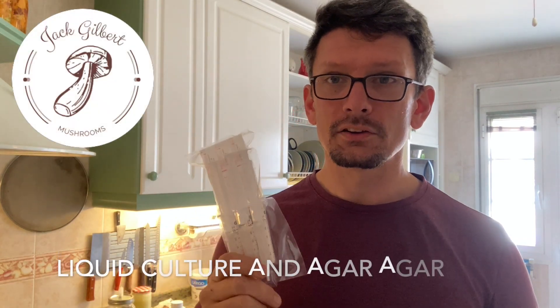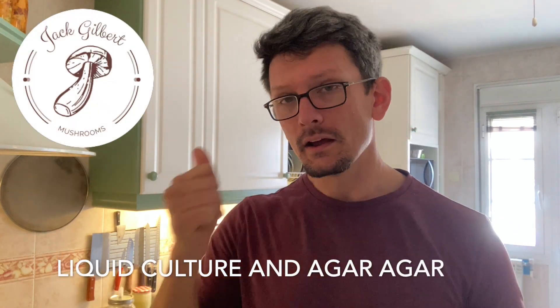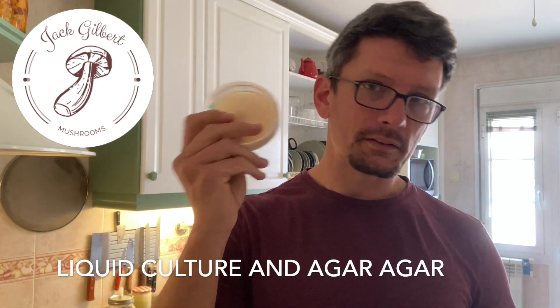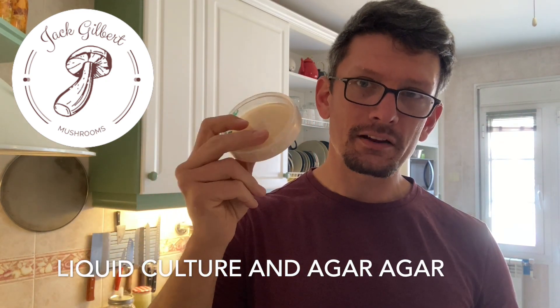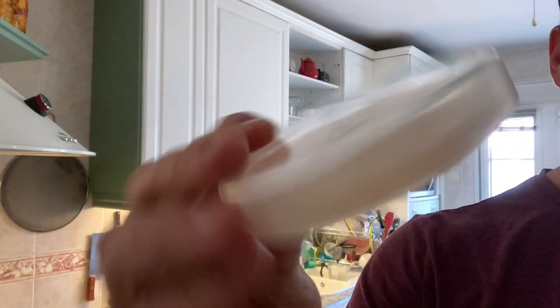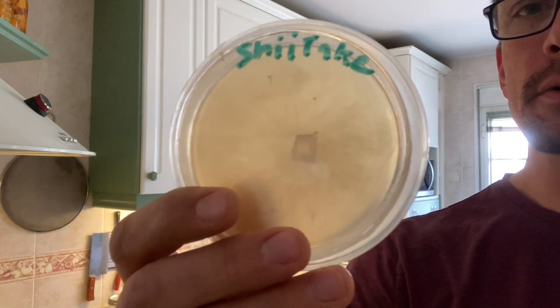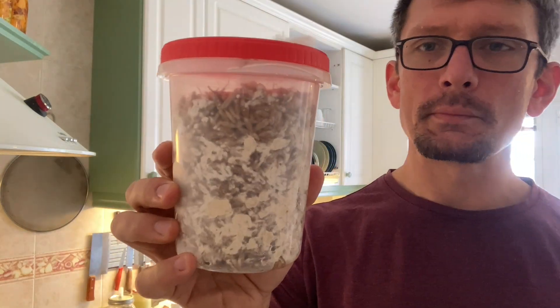Today I'm going to show you how to do two things: how to make liquid culture and agar plates. I'm not going to show you how to inoculate them, just how to prep them so they can be inoculated. This is a petri dish with agar agar that I'll use later to make grain spawn — what I'll use to inoculate my substrate so we can grow some mushrooms.